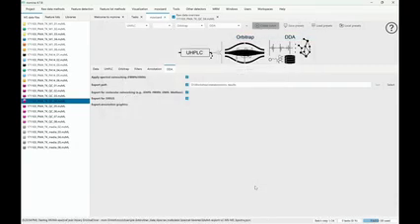That seems like it took a lot of work, but actually what we did was we dragged and dropped the files in mzmine. We set up this batch. There's a couple of parameters, and those are presets, right? We give you some presets for Orbitrap, but if you tune your instrument differently, you can run your instrument at different resolutions. You can tune it for different analytes. It might need some tuning, of course, right?